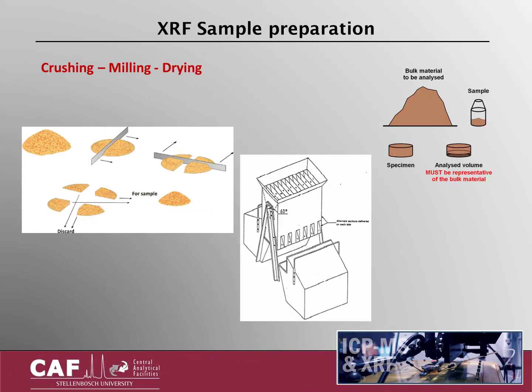Using a swing mill, the next step is to grind the sample into a fine powder of less than 80 microns. Most mill pots can only take a handful of chips, so the sample will need to be subdivided into smaller fractions. Overloading the mill pot can lead to a powder that is too coarse.